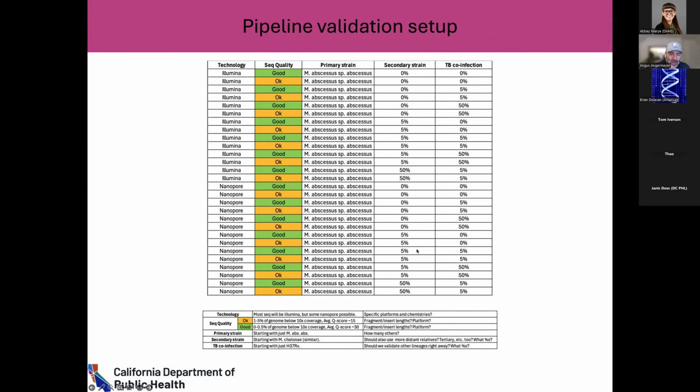One of the big restrictions here, and why this has become something of a difficulty for me, is that there's 2 or 3 main existing pieces of software for generating in silico reads, and they all are okay. Some of them are pretty good. But they don't have a lot of nuance or sophistication. You can't tune the sequence quality very well. The best one doesn't generate any kind of variable length within the sequence read. So you can say, here's the quality I want, here's the co-infection variable abundances that I want, but it'll make every single read exactly 250 base pair paired or whatever.